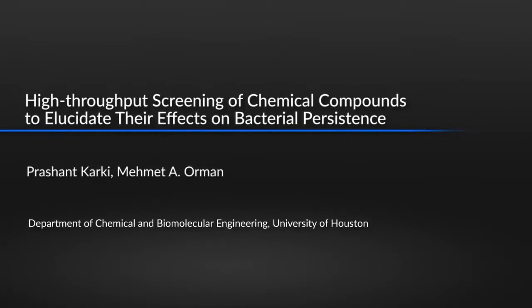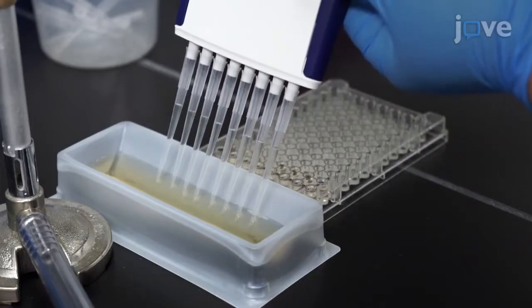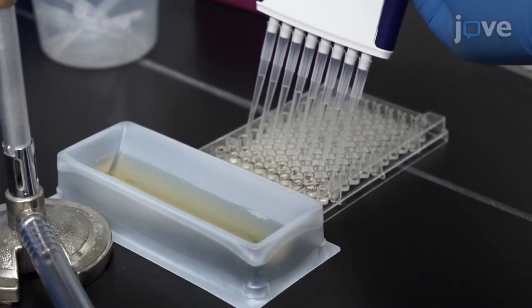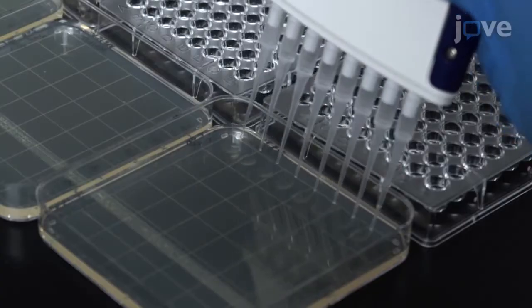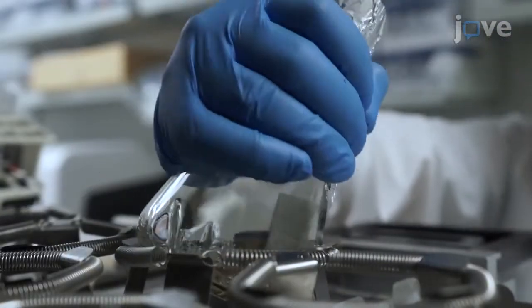The protocol described here makes it possible to identify conditions that can significantly impact bacterial persistence in a high-throughput manner. This method is readily adaptable to screen for various arrays such as drug panels, gene libraries, and more. As the method includes various sub-steps which are to be conducted simultaneously, visual demonstration can aid researchers to manage their timing to obtain precise results.